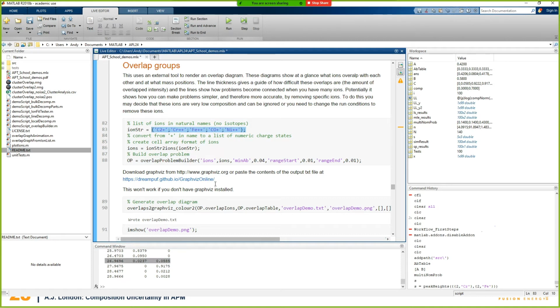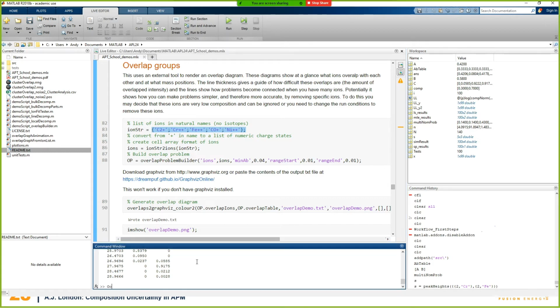Atom Probe Lab doesn't know anything about isotopes. So if you want to do isotopic doping, you have to modify the isotopes table, which I guess is one of the ground truths of the program. You can add whatever elements you want. So if you want to add uppercase O, lowercase o, something like that, whatever.